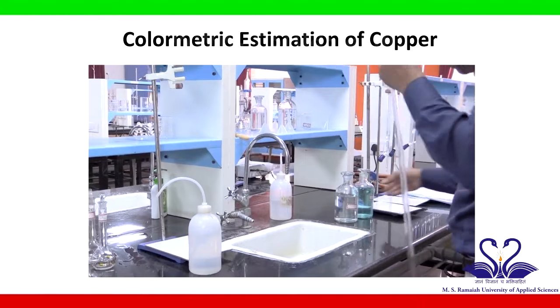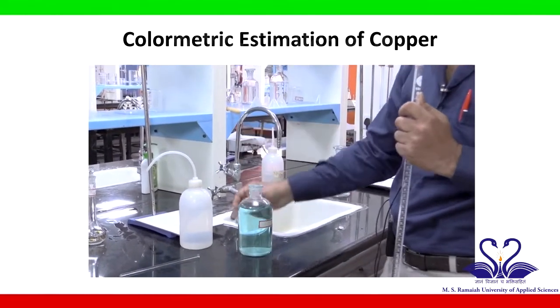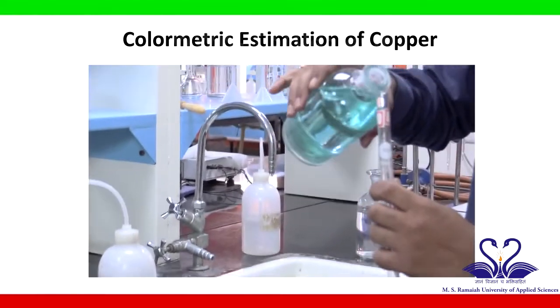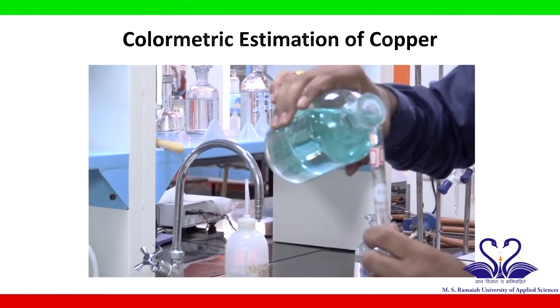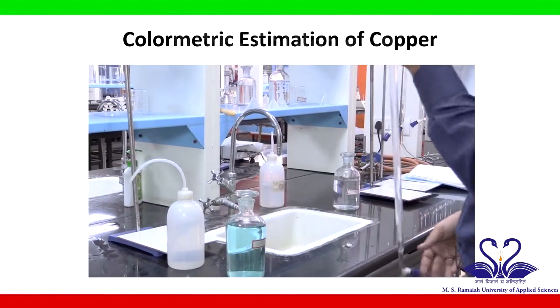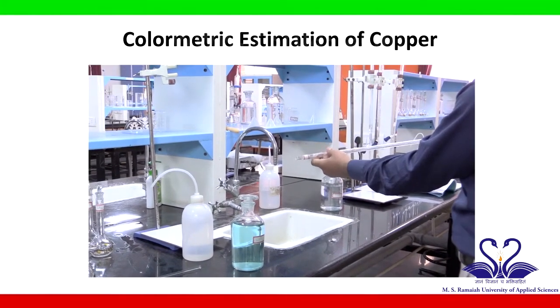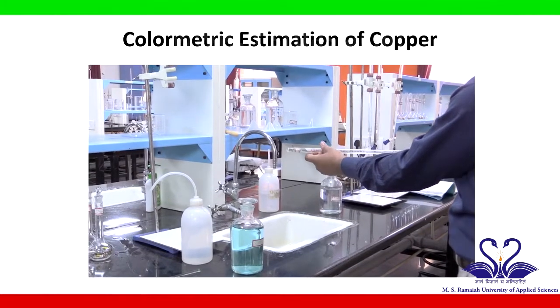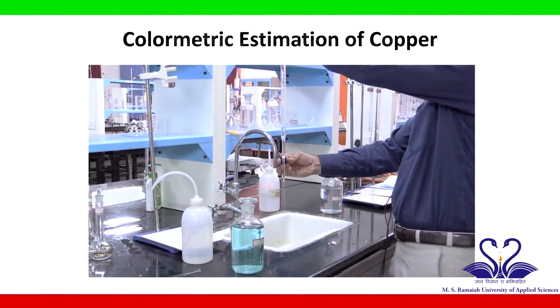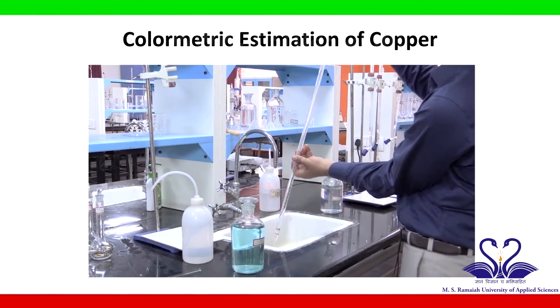And then it should be rinsed with the given standard copper sulfate, it should be rinsed with the given copper sulfate. So now the apparatus is ready.